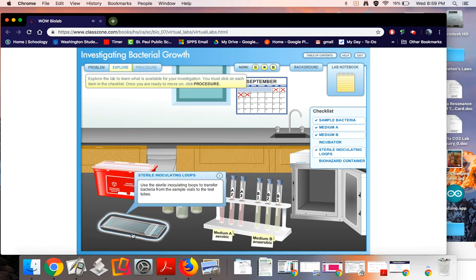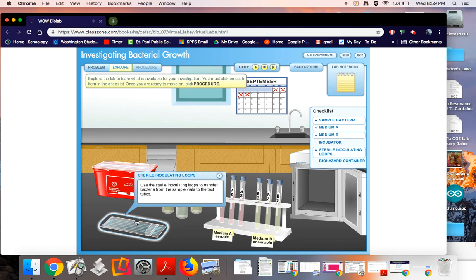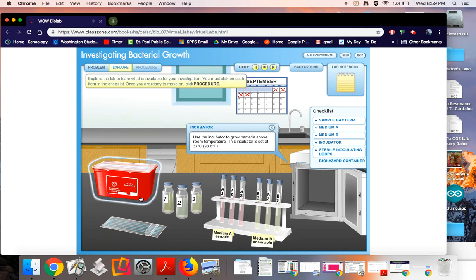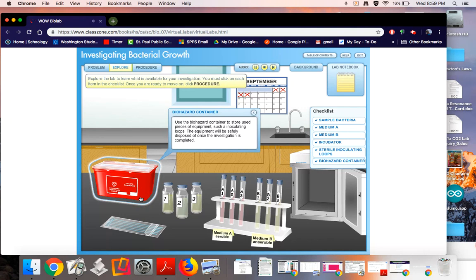Sterile inoculating loops: use the sterile inoculating loops to transfer bacteria from the sample vials to the test tubes. Incubator: use the incubator to grow bacteria above room temperature. This incubator is set at 37 degrees Celsius, 98.6 degrees Fahrenheit. Biohazard container: use the biohazard container to store used pieces of equipment such as inoculating loops. The equipment will be safely disposed of once the investigation is completed.